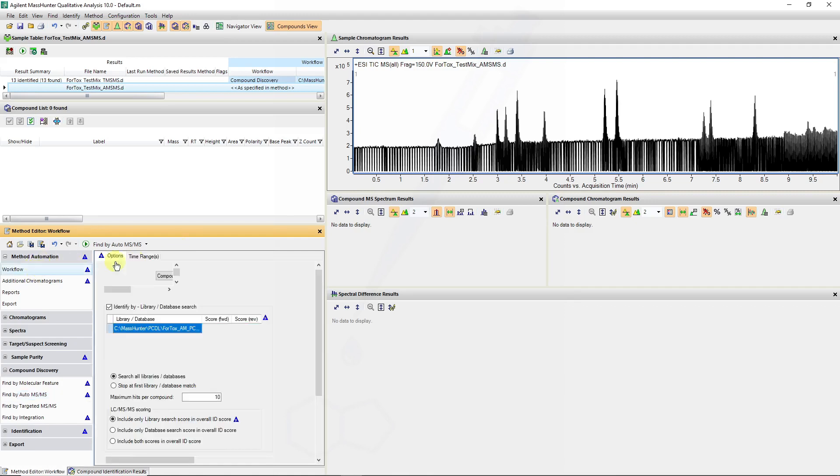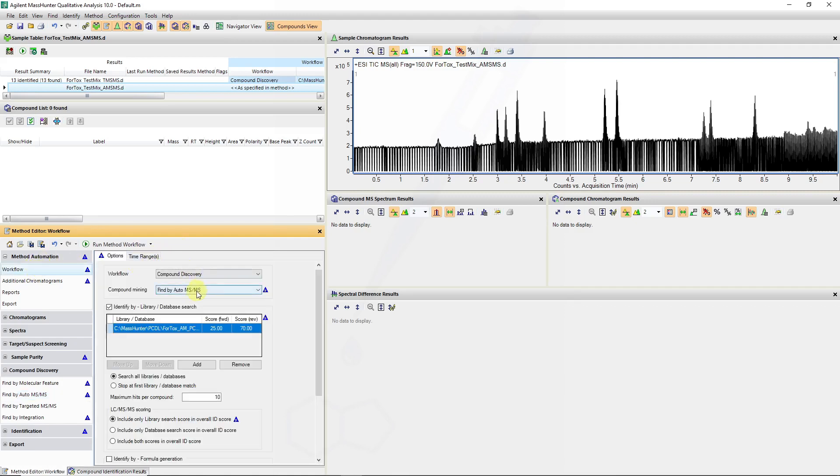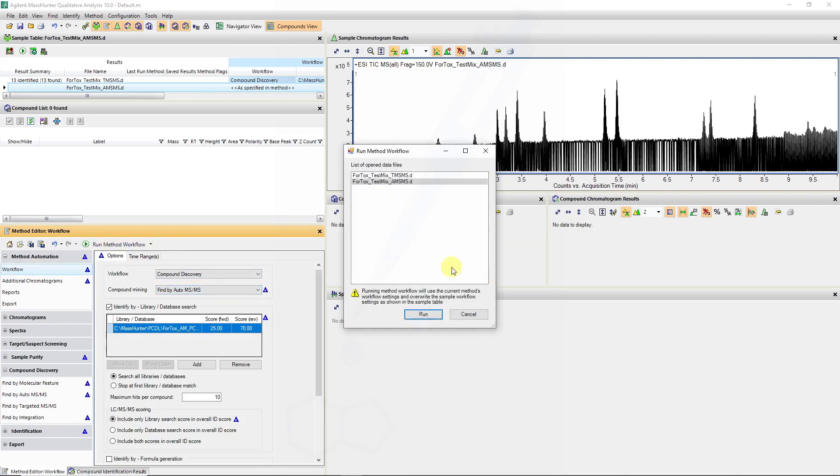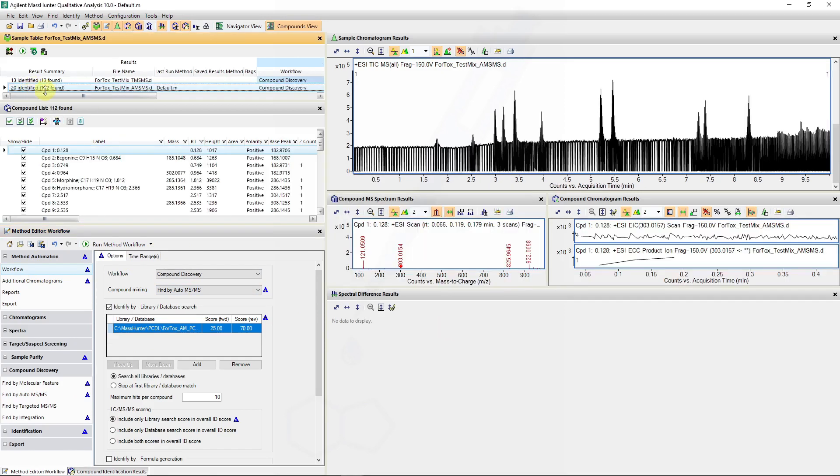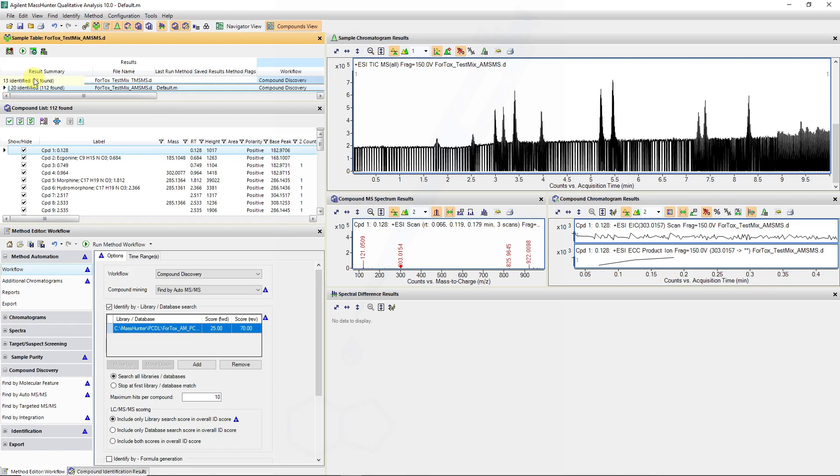So running through the workflow for auto-MS-MS tests we can verify the results from there. So 112 unknowns of which 20 of them were identified. Contrast that to the targeted methods where we only have a target list of compounds we were interested in. So you can see you can do a little bit more screening using auto-MS-MS.